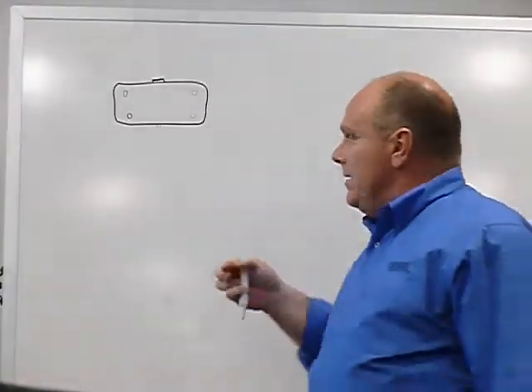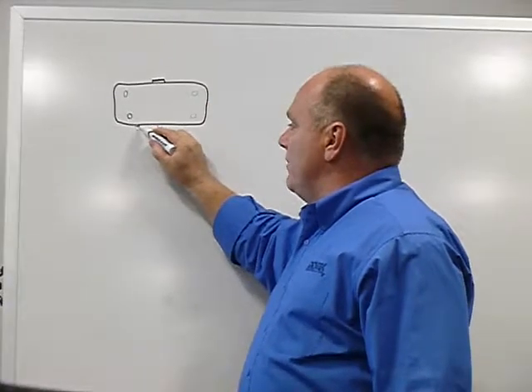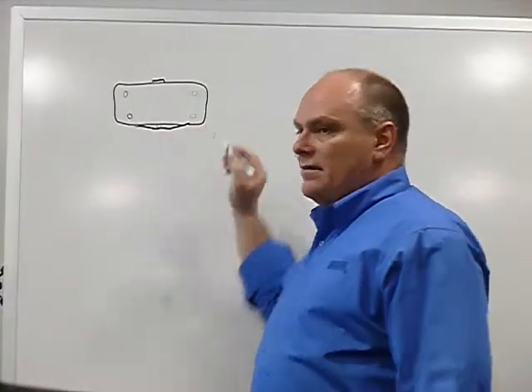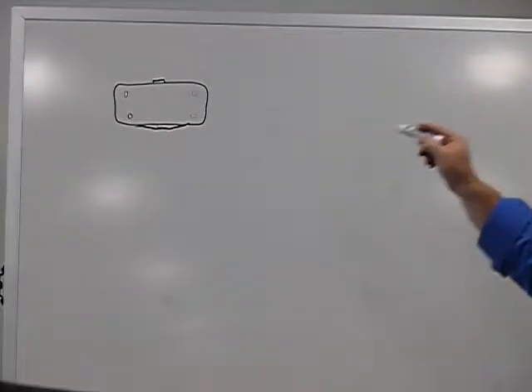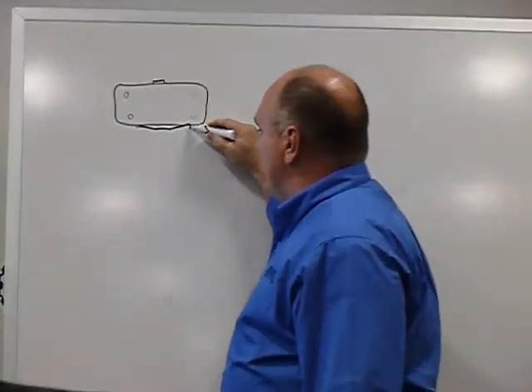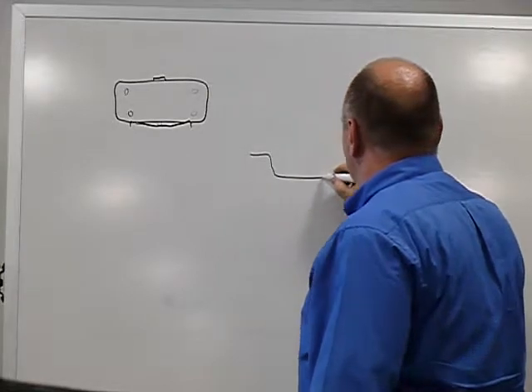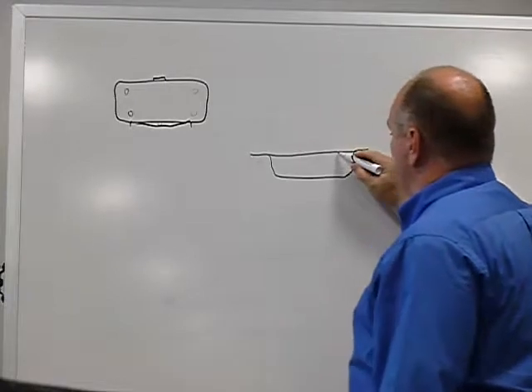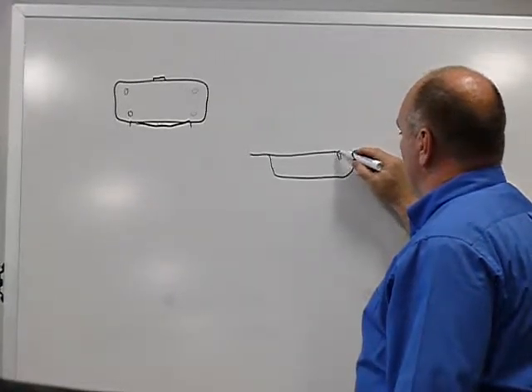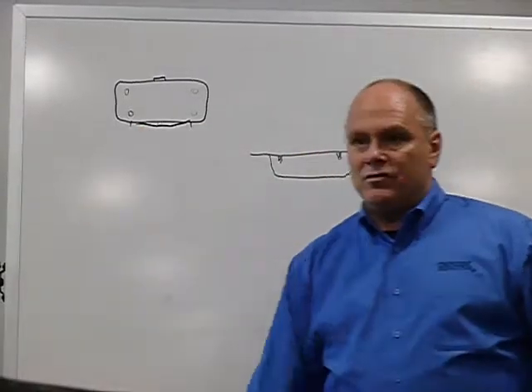But what happens is it pops off of this clip right here. As this gets older, it has a tendency to bow out here, the plexiglass. So you got to pay attention to the bath itself. Once it starts doing that, it can start forming cracks, stress cracks in the glass. So when you're looking at it from the side, you'll start to see some stress cracks come down in here. These fine little lines start to get out here where the bowing action starts happening. Something to look out for when they're talking about inspecting the bath.